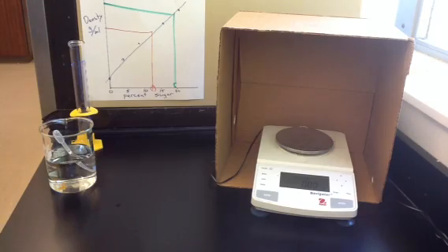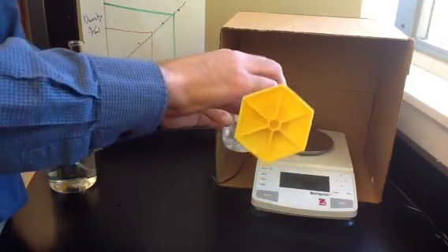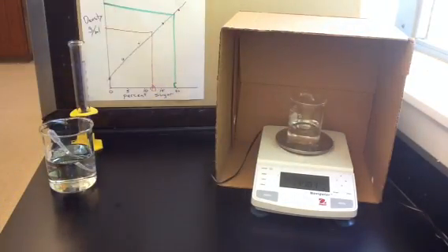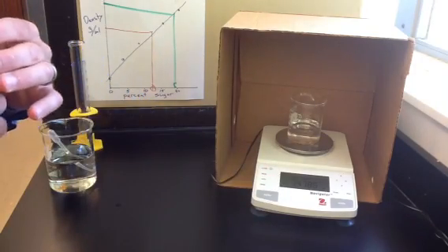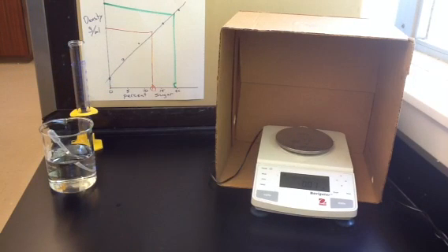We'll try one with 15%. So we have 100 milliliters measured out again. You can see that the mass is getting slightly heavier as we increase the sugar concentration, and that's what we expected. Your graph is going to look like this, increasing density with increasing sugar percentage. For the 15% sugar solution, we have 197.86. 197.86 for the 15% sugar solution.